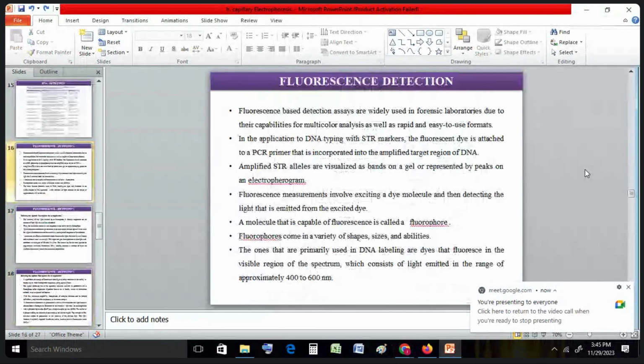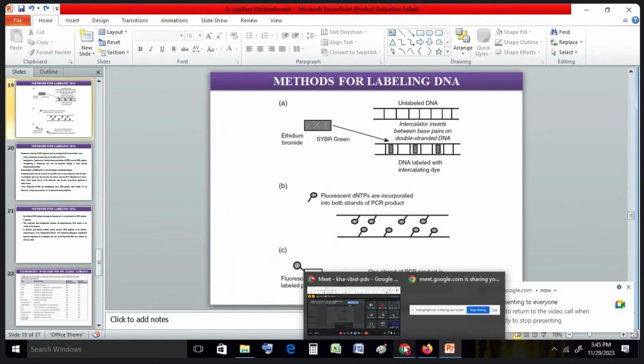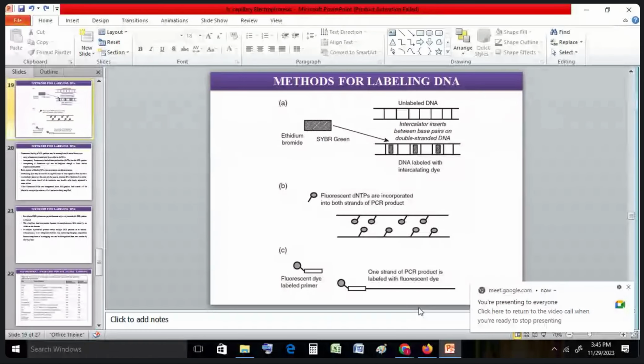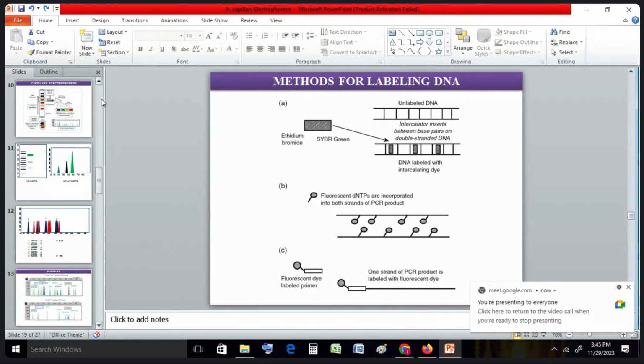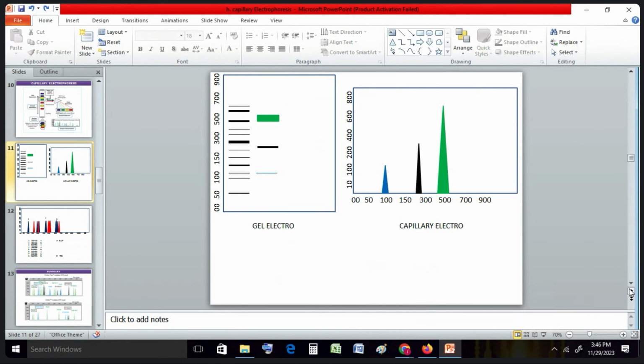Sir, how do we identify homozygous and heterozygous? I missed it. Yes, if you can recall, for example, let's think this way, get back to this picture, it will be easy for you. For example, take a single locus that has 15 and 20 repeats together.